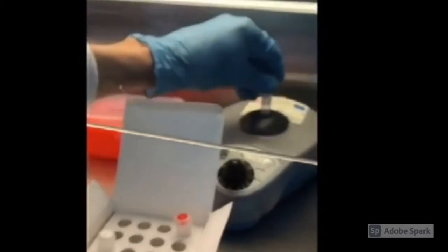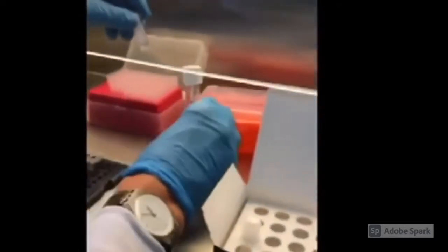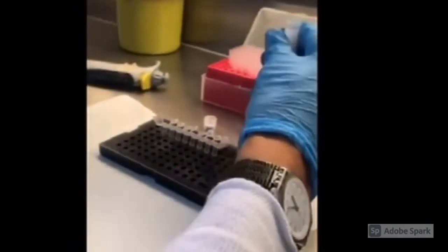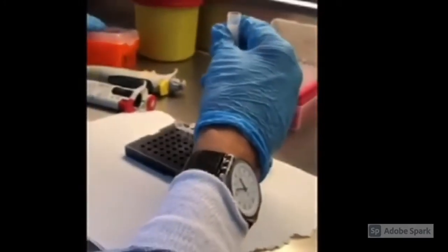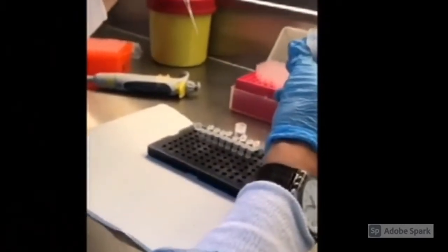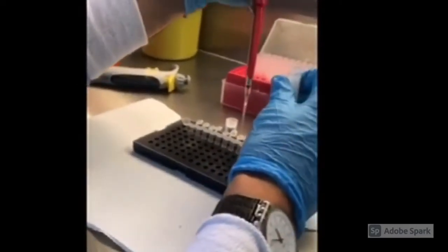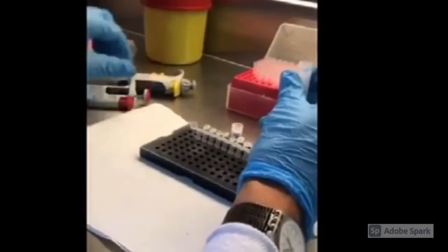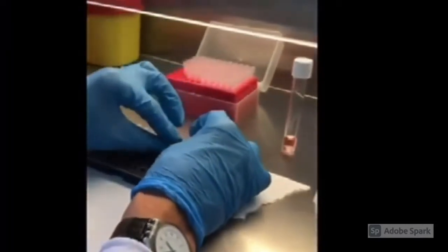And this is the primer for ORF1AB gene. And we put 4.5 microliters of this primer. We put 4.5 microliters of primer mix of ORF1 to the first tube. And then we close this tube.